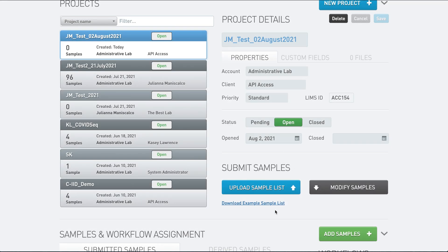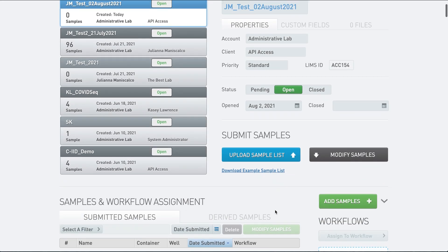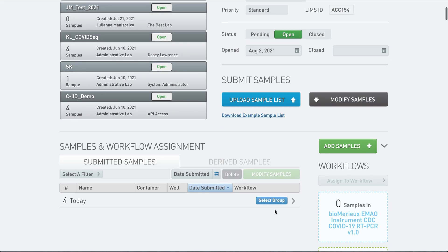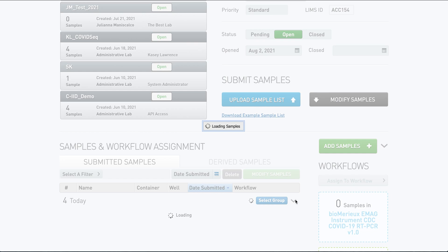If you scroll down, you will see that all four — or however many — samples have been uploaded to the project, and you are now ready to do work with them.